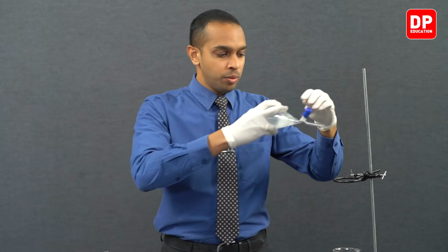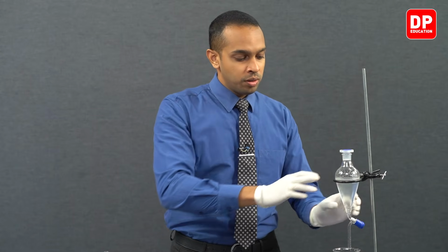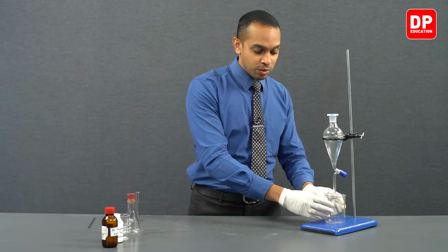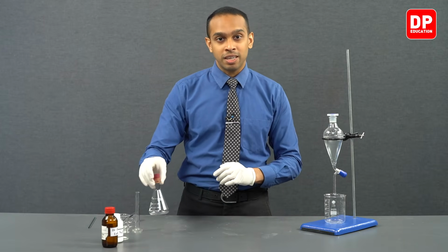We will now place this in the stand and we'll allow it to settle down and separate out into two layers. After it separates into two layers, we will be using the stopcock again to separate the aqueous layer from our organic solvent layer, in this case from our diethyl ether layer. So let's wait for a few minutes and then let's remove the aqueous layer into this beaker and the diethyl ether layer into our Erlenmeyer flask we have here.